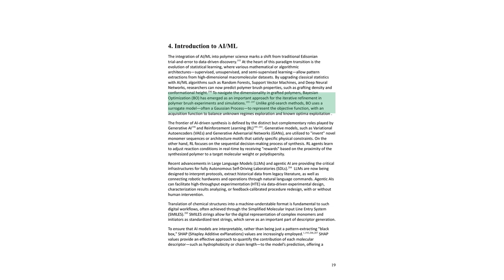It uses a surrogate model to build a probabilistic map of how inputs relate to outputs. It then uses this map to decide the next best experiment to run, one that balances exploitation, testing in areas it knows are good, and exploration, testing in areas of high uncertainty to learn more. This makes the process of finding optimal conditions for synthesis or performance much more efficient.